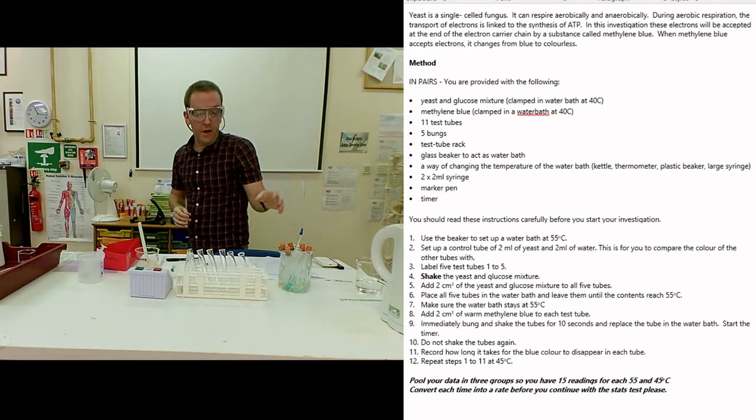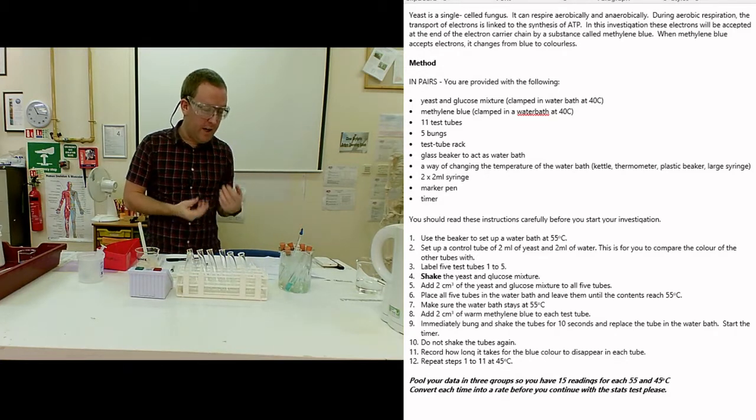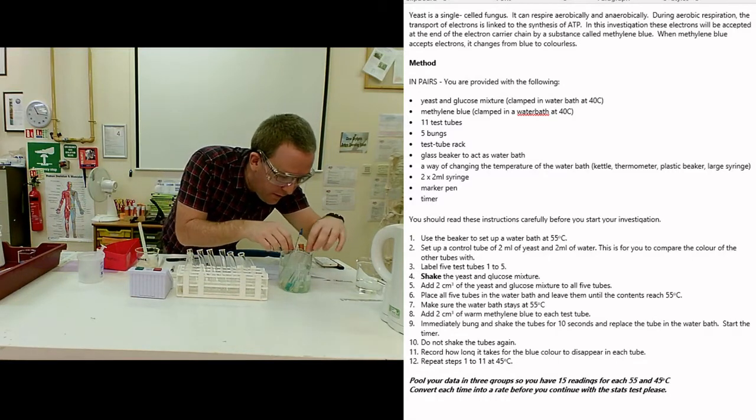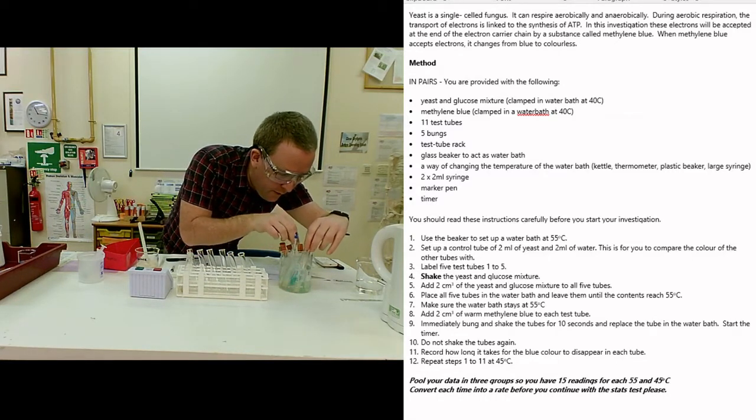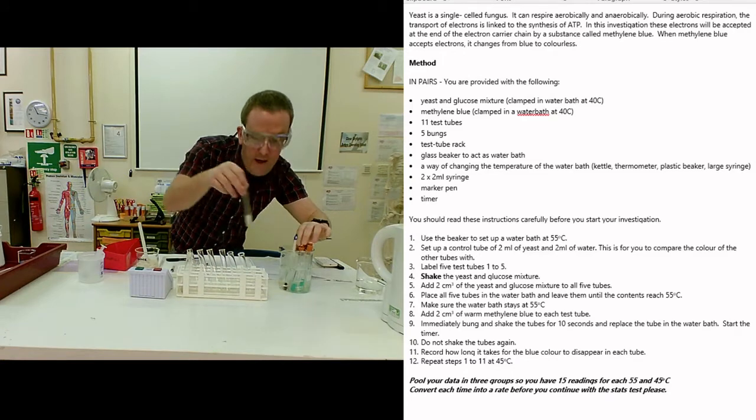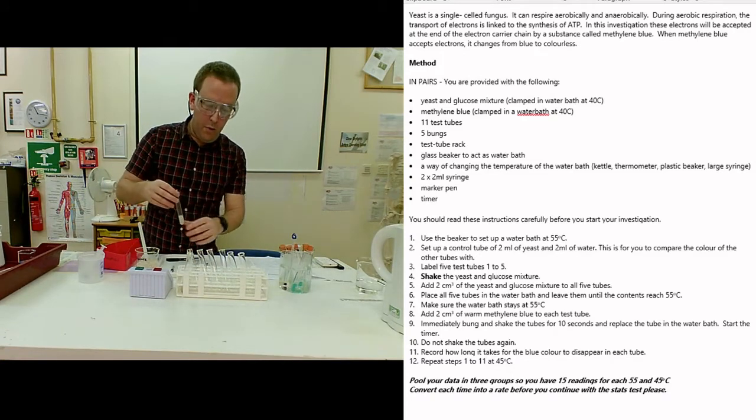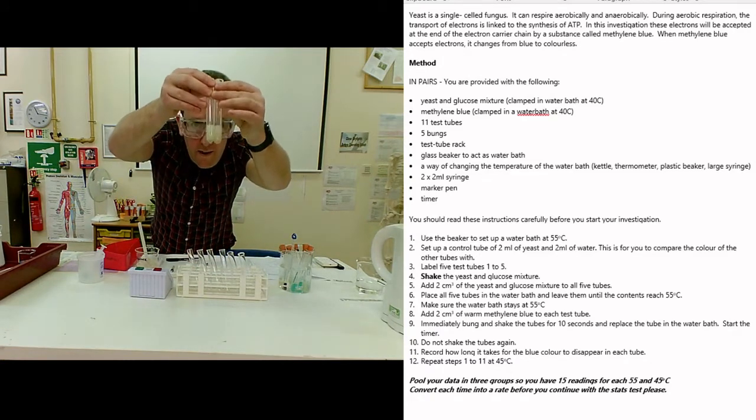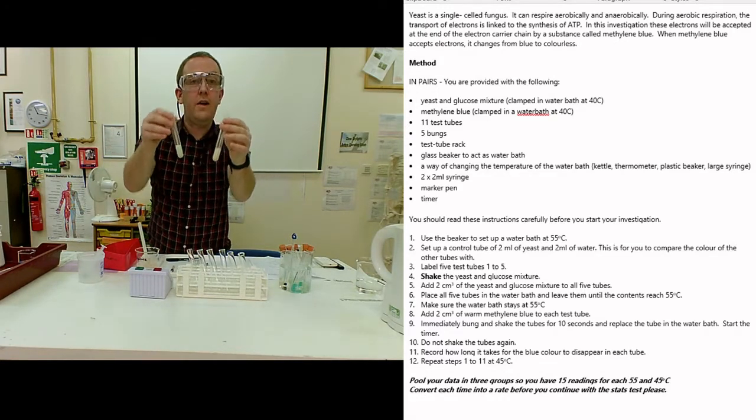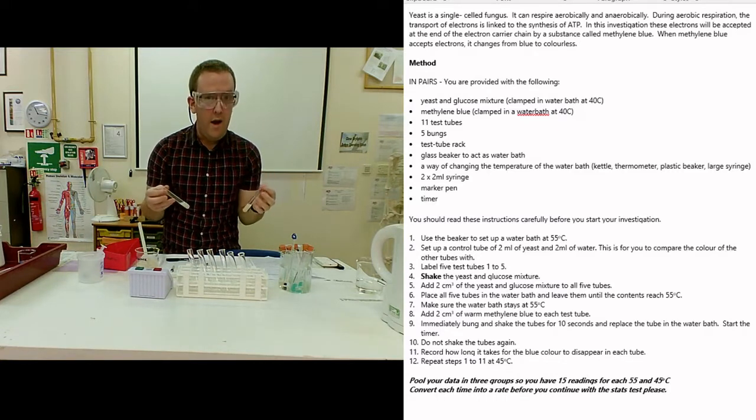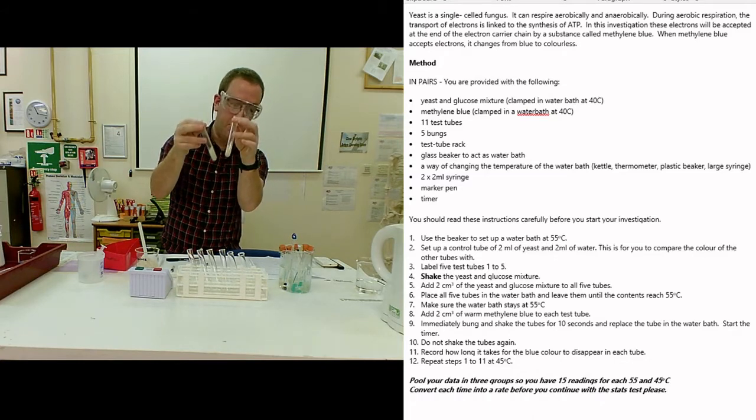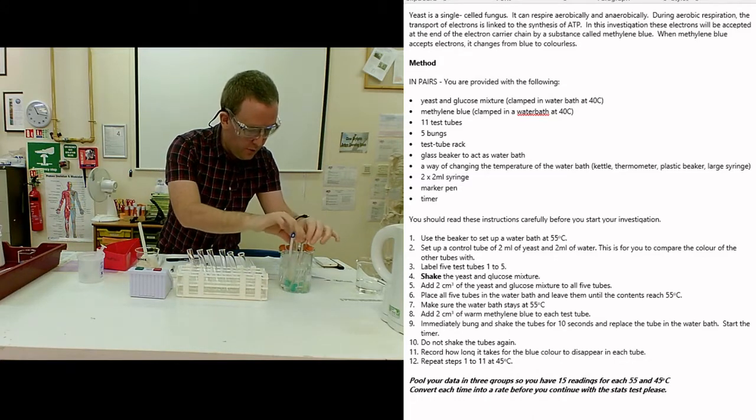All right, now we'll be keeping an eye on those for as long as they take to decolorize. But in true Blue Peter fashion, I have a 'here's one I made earlier'. Your stopping point - you compare that to that. Now I know those are not exactly the same color, but you're going to have to make that decision yourself as to when this is decolorized, as to when this has lost its blue color. That's the point at which you stop.